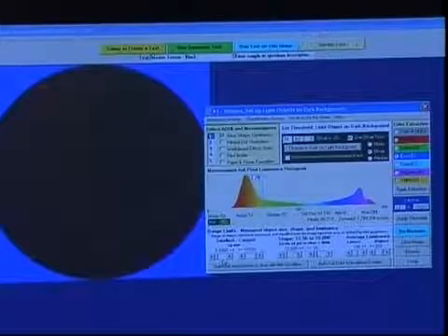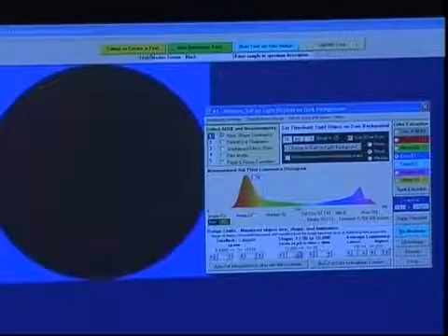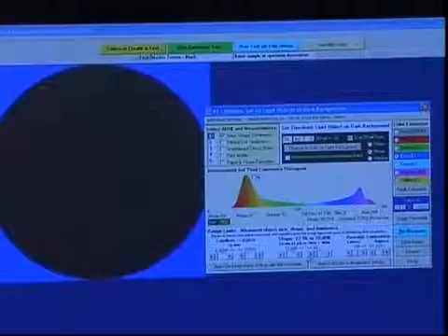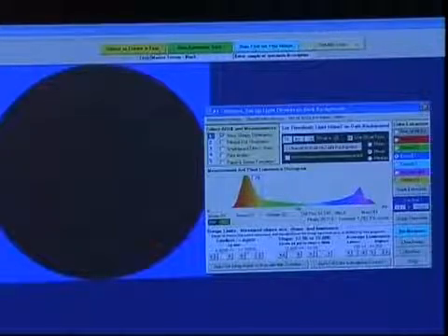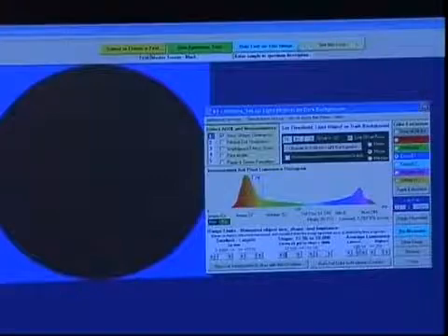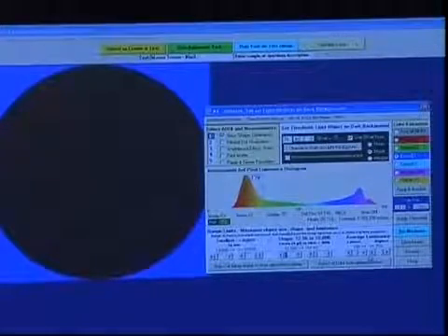We'll set the minimum size to be 0.08 and above. The shape we're looking for is those that are round, between 12.57 and 45. The scroll bars control this very, very carefully and very easily. And the average luminance now, we want only the white materials. So we'll set the lowest area to be 130 to 255. And this will do the stickies.